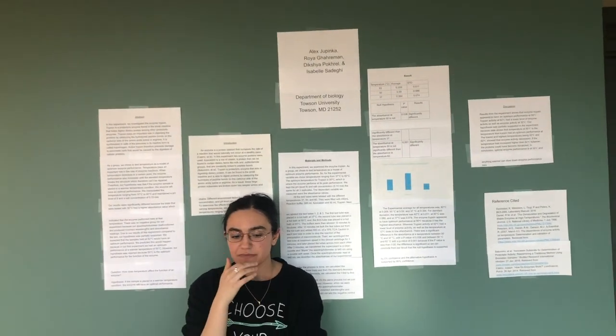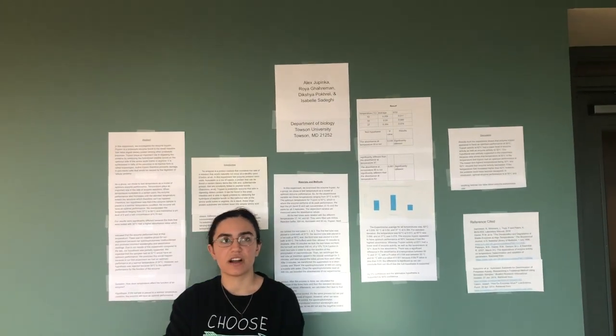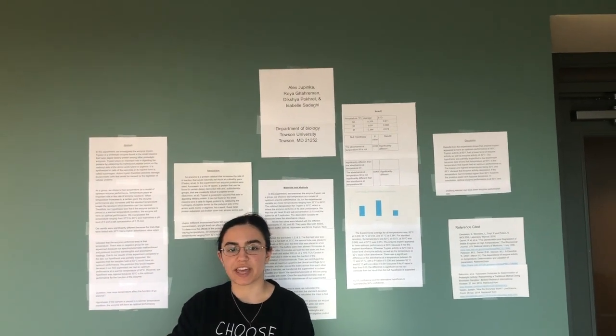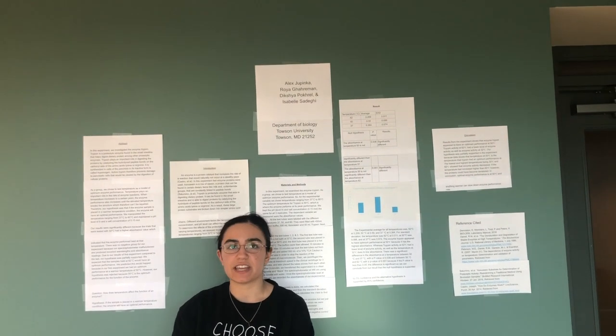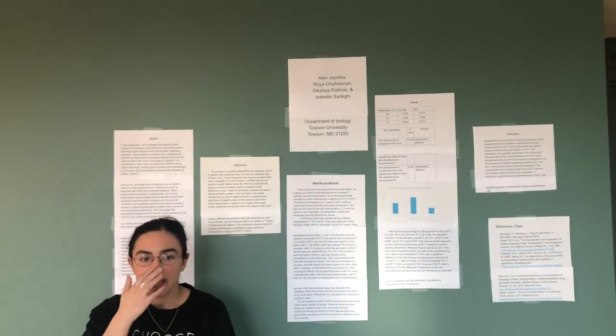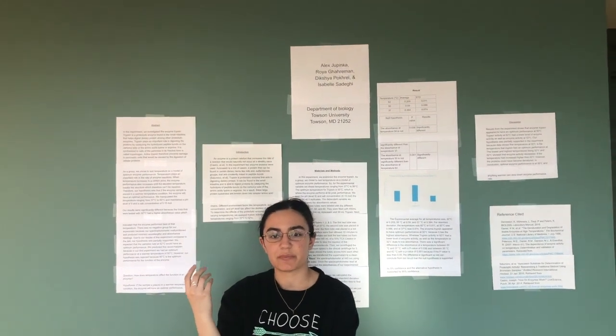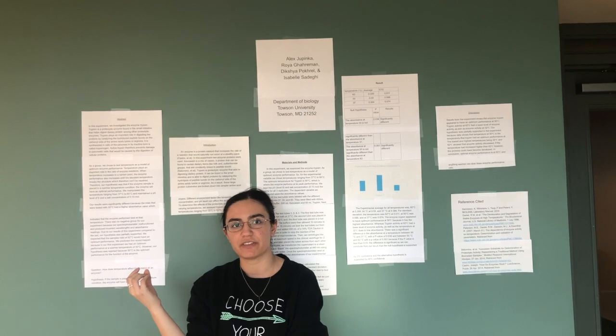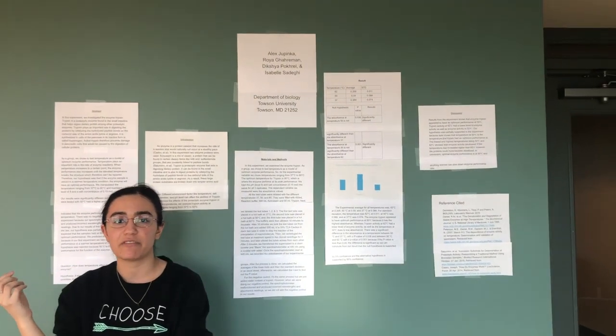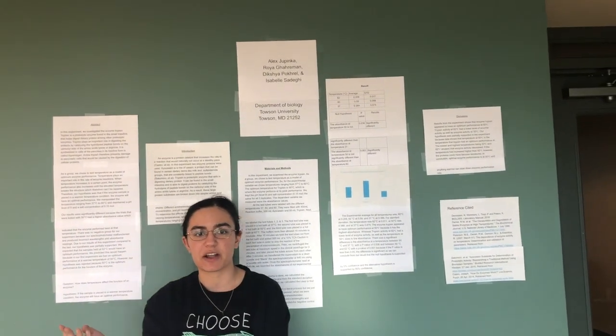So the conditions for our experimental variables were that the temperature variables were at 37, 50, and 60 degrees Celsius. And our condition for pH was a pH level of 9, and our salinity concentration was 0.15 moles. And now for the steps of our experiment.